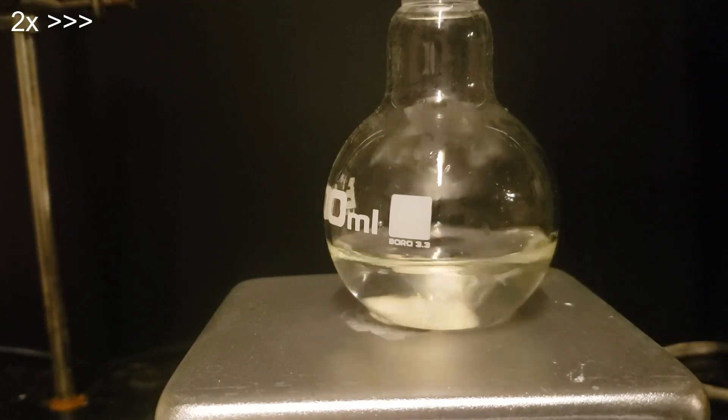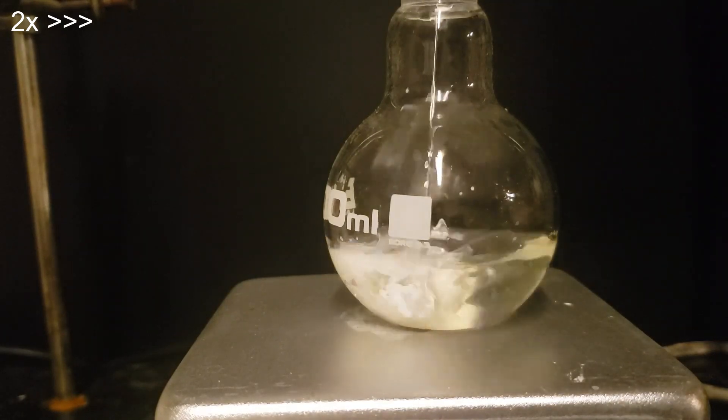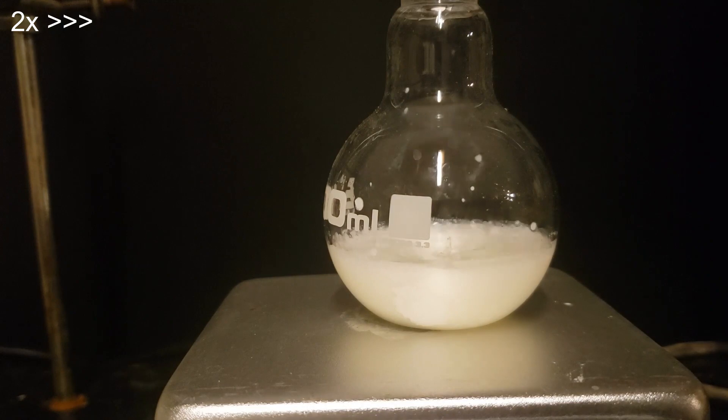The tetrabutyl ammonium bromide solution is pipetted in, forming a curdy white precipitate of tetrabutyl ammonium octamolybdate.